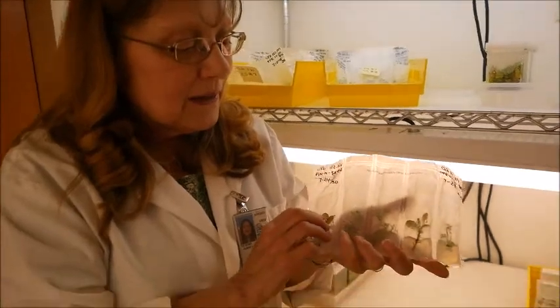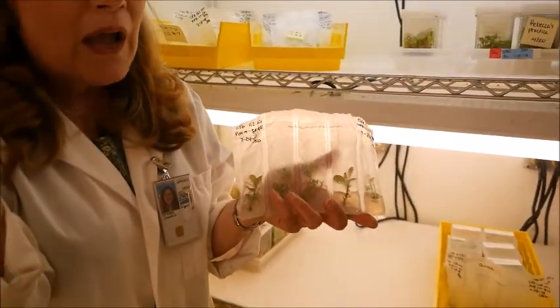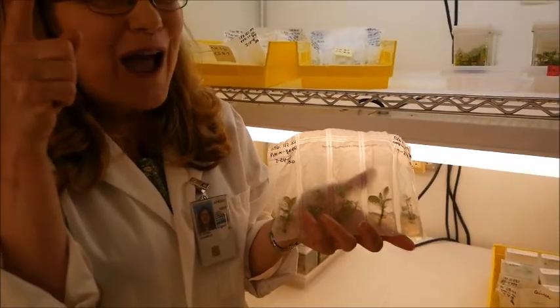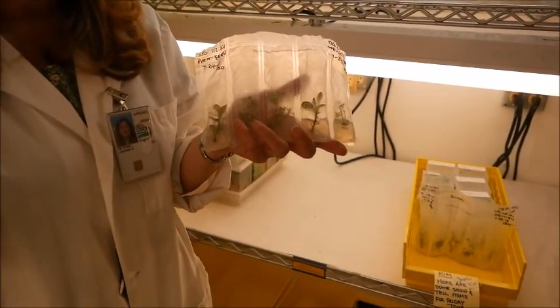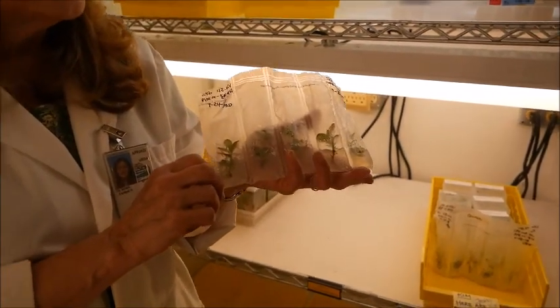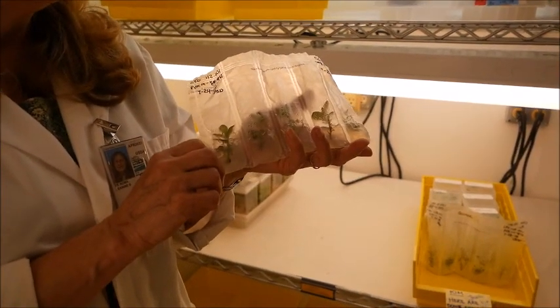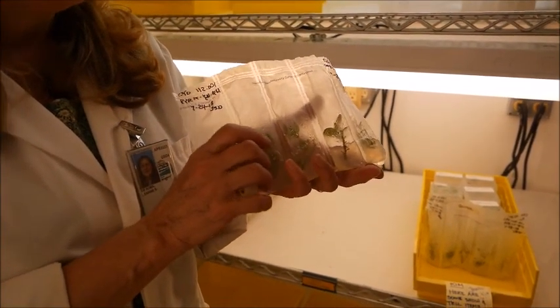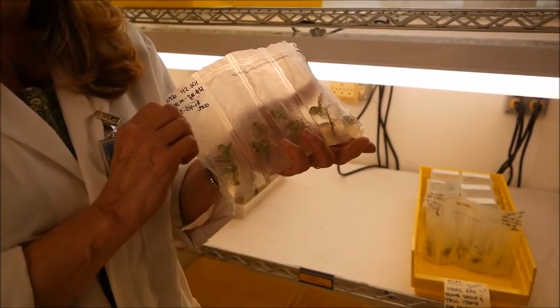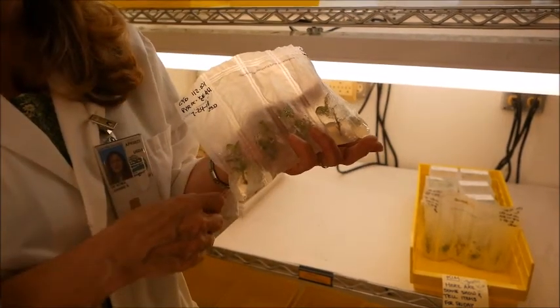So we store them in these bags, have them go into dormancy, and put them in the walk-in cooler. That's where my 1,500 accessions are actually living, not here in the growth room. It's a bit like putting herbs in a glass of water in the refrigerator — they last a while but eventually die back. This is different though: they've got nutrients and they're kept at refrigerator temperature, around 4°C.